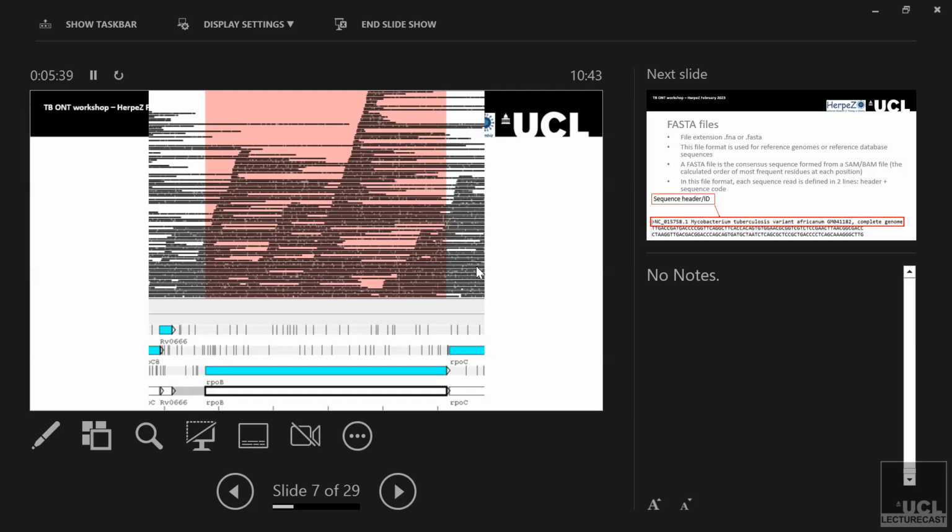What you need to do, though, if you want one single read or one single base for each of your sections, is to then convert it into a FASTA file, like John was saying earlier. What that does is it compresses them all down. And this is where depth is really important. When you change it from a BAM file to a FASTA file, the computer takes every read at each point and says, right, okay, we've got 50 of these, 90% of them are A, 10% of them are G, so let's say that's probably going to be an A.